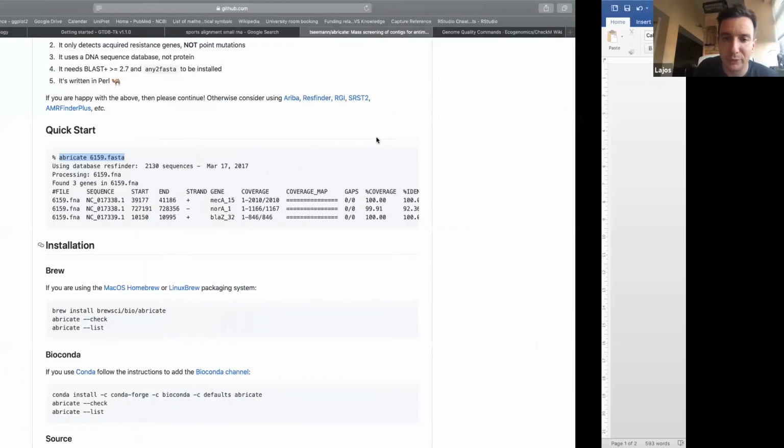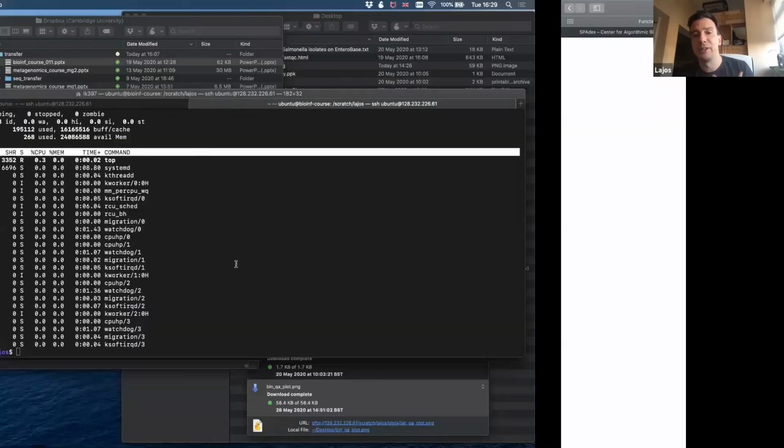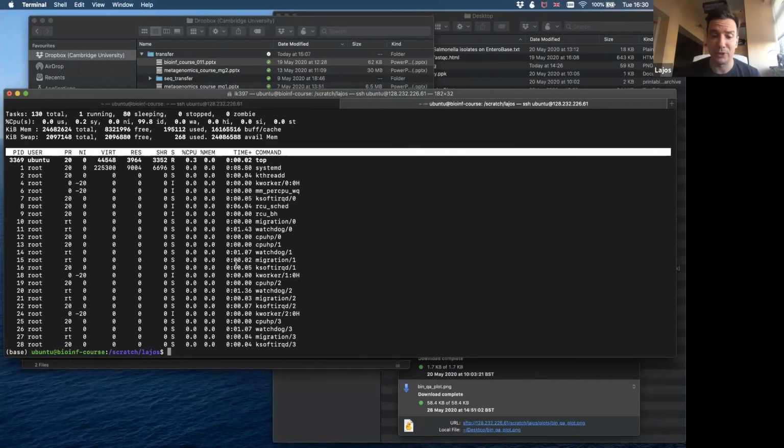I also tried to include a few of these troubleshootings or QCs. What are those things that you have to look for in each step, especially in the pre-assembly steps? How can you become suspicious that something went wrong during the library preparation or sequencing or during your pipeline, and what can you do? Okay, if there are no questions, then I will only ask for a few more minutes. I won't fill up the 2 hours today.